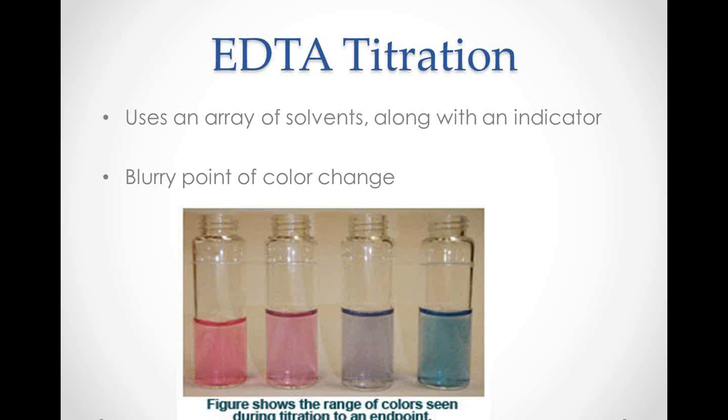A similar process is the titration method, with EDTA currently being the most widely used due to its shorter analysis time as compared to, say, the Versene method. Using a mix of EDTA, hydrochloric acid, calcium carbonate, and hydroxynaphthol blue indicator, a user can more efficiently determine the hydrolyzed calcium in the sample. However, this process is a very user-dependent titration, so human error always has the option of skewing results. I know I, for one, am not a patient enough user to get the correct measurement every time. I know the technicians out there might be in the exact same situation.